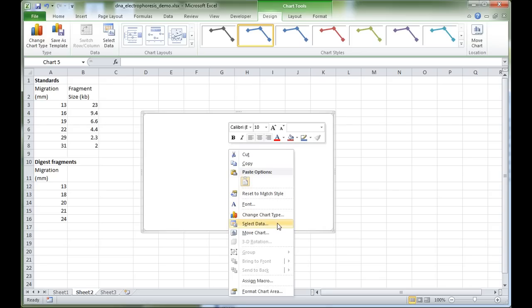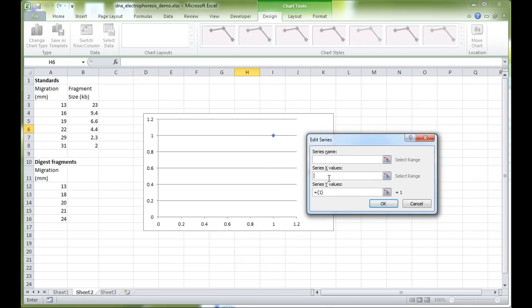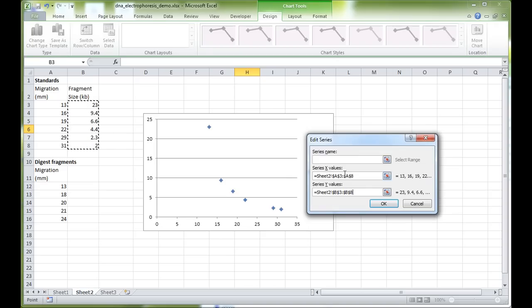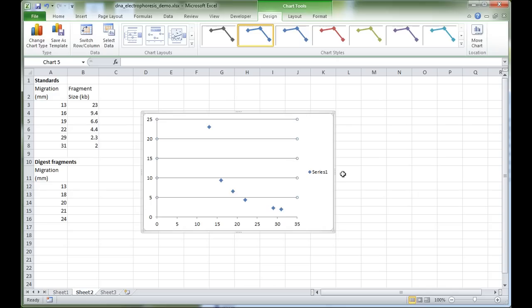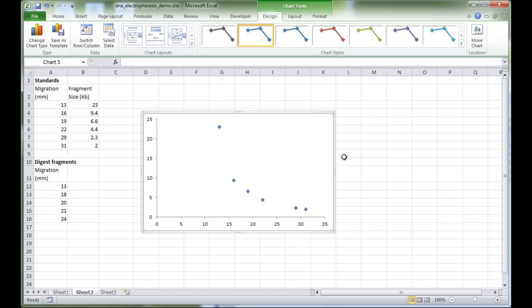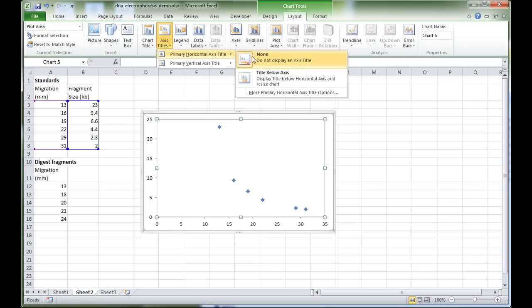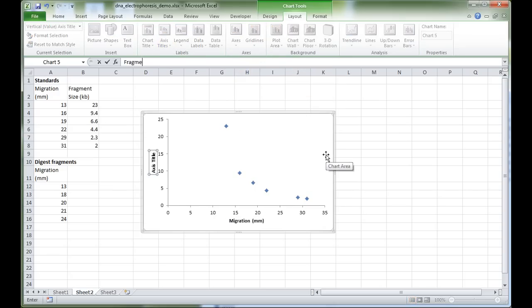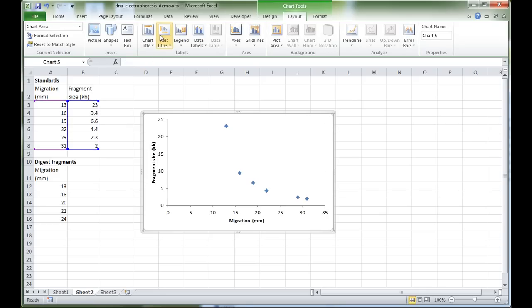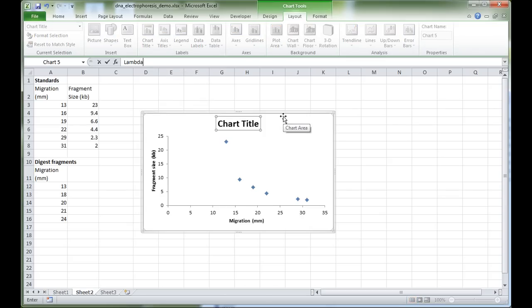Right-click on the blank area of the graph, select 'Select Data', and add a series. The x-values will be the migration data, and the y-values will be the fragment size. Press OK. Let's get rid of the horizontal grid lines by selecting them and pressing Delete. Now let's add axis titles: the primary horizontal axis is 'Migration in millimeters', the y-axis is 'Fragment size in kilobases', and the graph title is 'Lambda HindIII Standard Curve'.